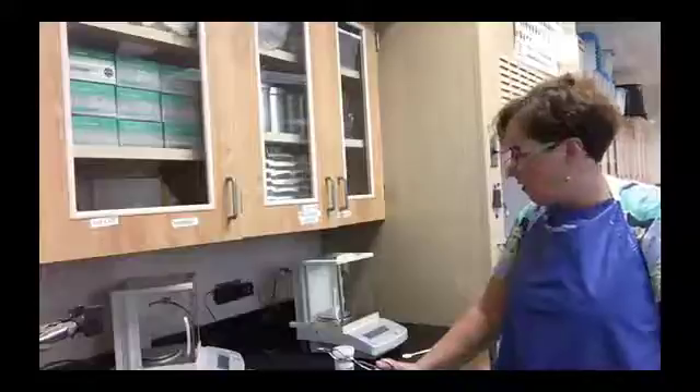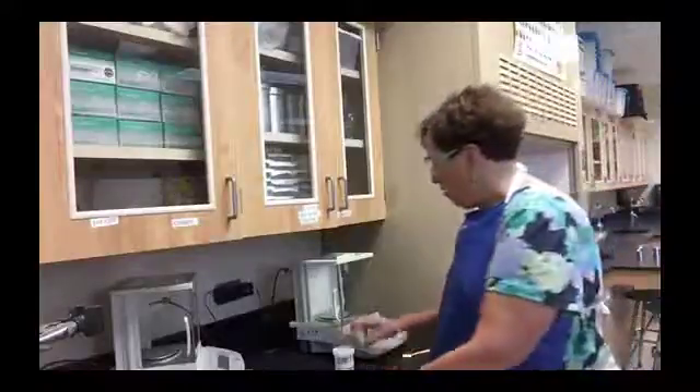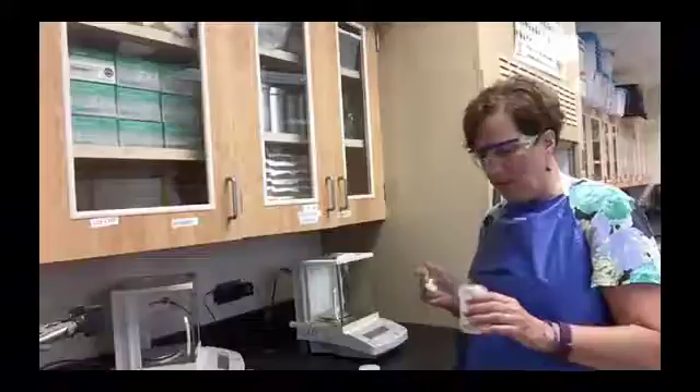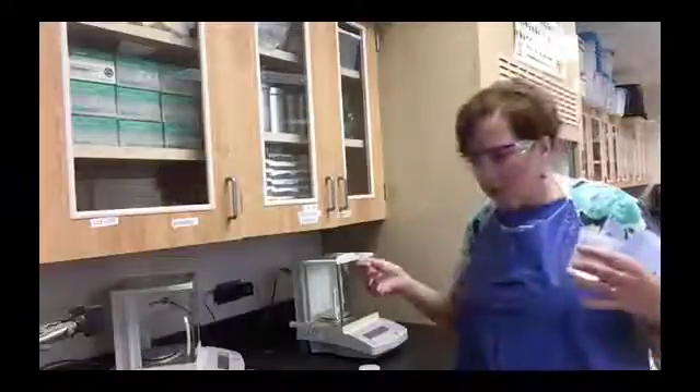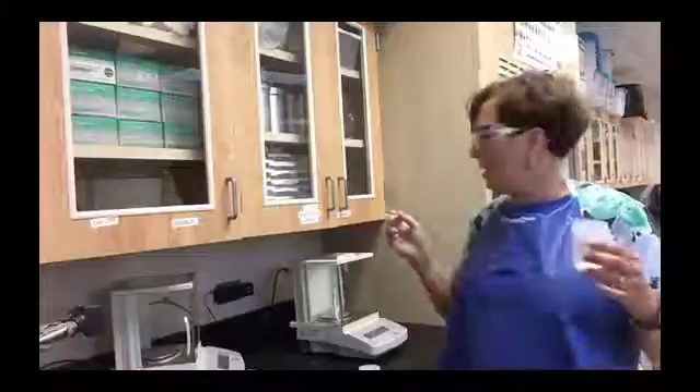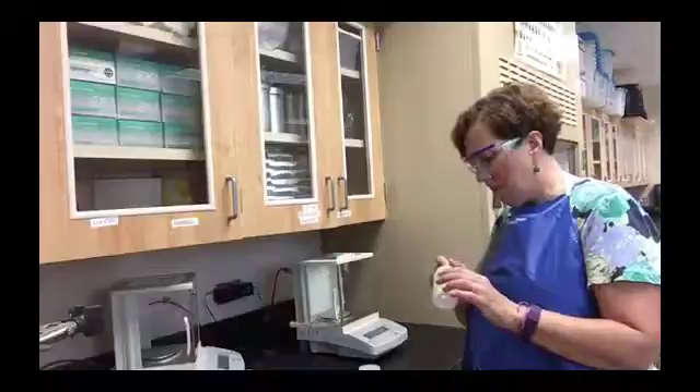Then you're going to take some amount of your hydrate that you have decided — let's say 1.0 grams. You're going to add about a gram. Don't try to get exactly 1.000 grams because you will be here all day. What you want is about a gram. So if it's 0.976 grams, that's fine. If it's 1.037 or 1.166 grams, as long as you know exactly what it is, it doesn't matter exactly how much.